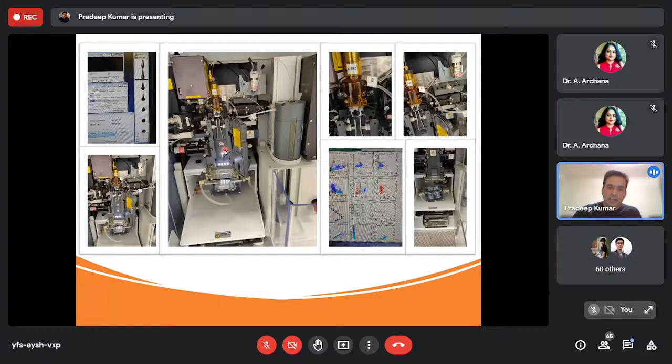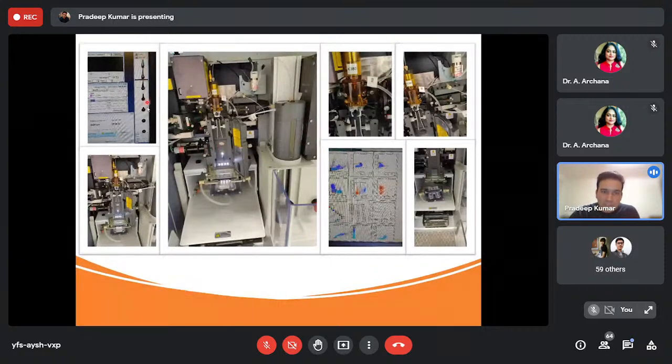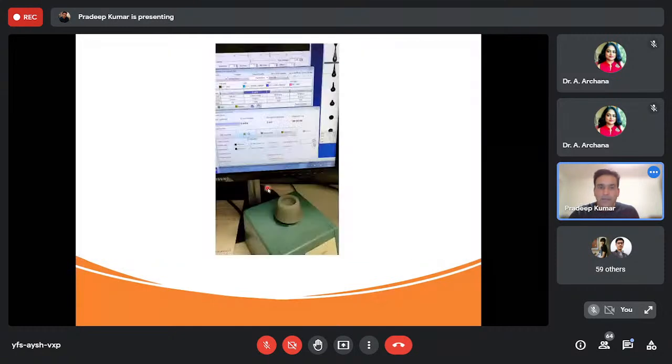Okay, so that's the inside of the flow cytometer. That's how it looks. This is the sorting block, and the stream goes from here, and there is a camera in here which takes the image, and that's the image of the stream that you see. Now, these individual drops, carrying your cell or not, will go through these deflection plates and be sorted based on electrostatic attraction and repulsion to the left, to the right, to the far left, to the far right.